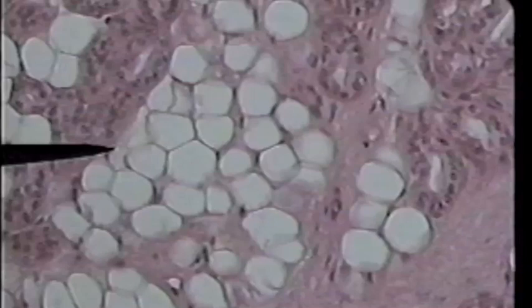If you look carefully, you can see on the edges of these cells little black dots — at least on some of them. Those are the nuclei that have been smashed over by the large vacuole that is storing the fat.